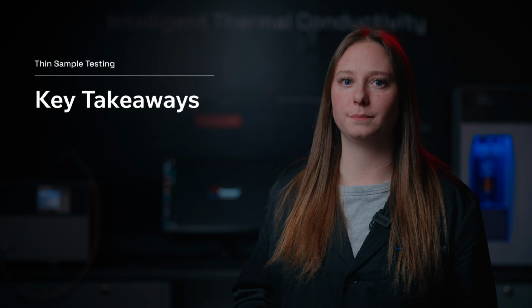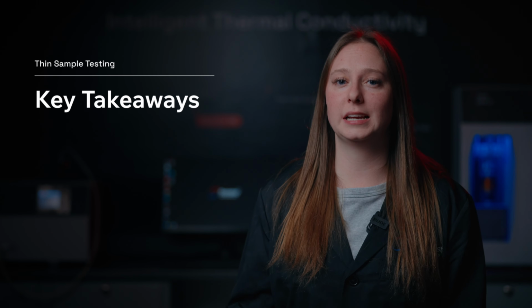Here's the key takeaway. Accurate thin film sample testing depends far more on preparation, setup discipline, and method selection than on the instrument alone. Contact resistance, surface flatness, and pressure uniformity must be controlled, and bulk testing approaches shouldn't be applied blindly to thin films. With the right thin film method, the fixtures, and careful setup, you can generate reliable and meaningful thermal data, even for the most challenging thin films.